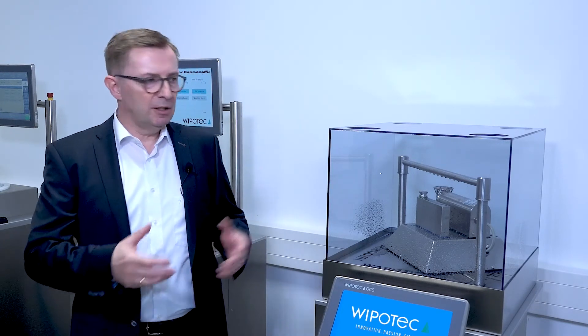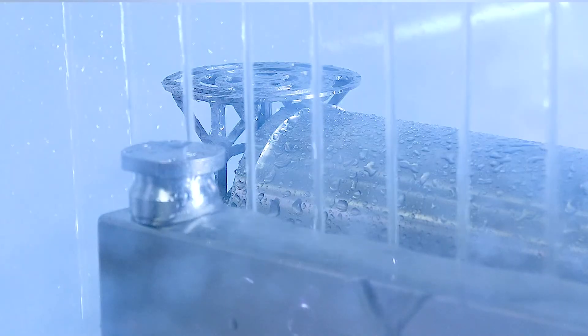There are different requirements for cleaning. With our weigh cells with the wash down mode option, available in both stainless steel and aluminum versions, you are fully covered. As you can see, I switch it on — and here you see the water running.